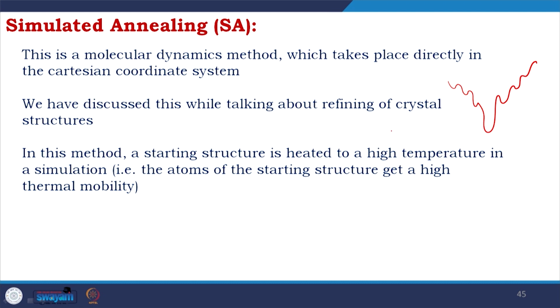So, what happened, if you remember, I talked about there are many possible maxima and many minima, right. So, when you are developing a model, your model might be coming and restricting to any of these local minima, and your goal is to go to the global minima.